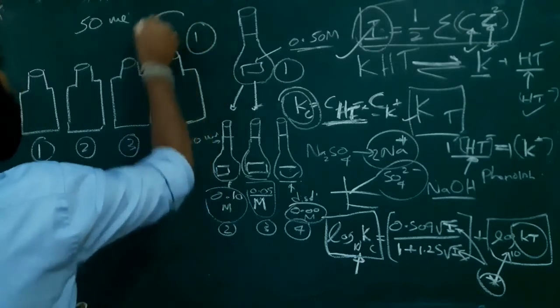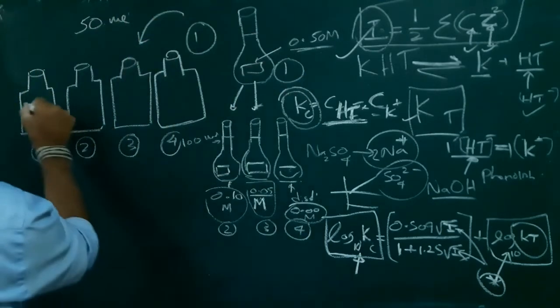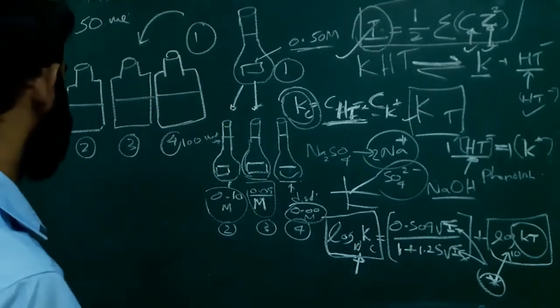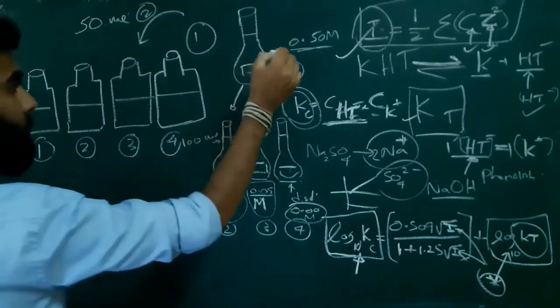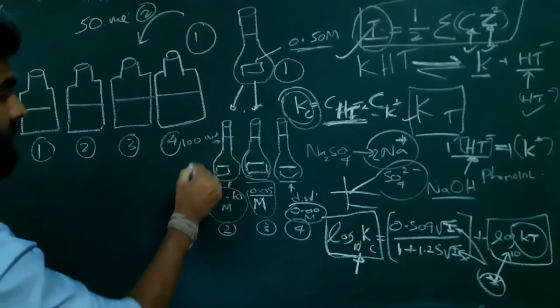We got 50 ml of each solution into 4 different stoppered bottles. The first thing was the preparation of these solutions, dilution and 100 ml solutions.